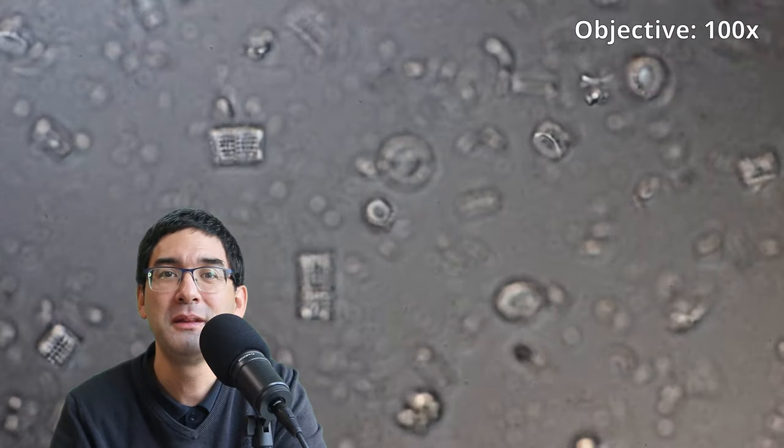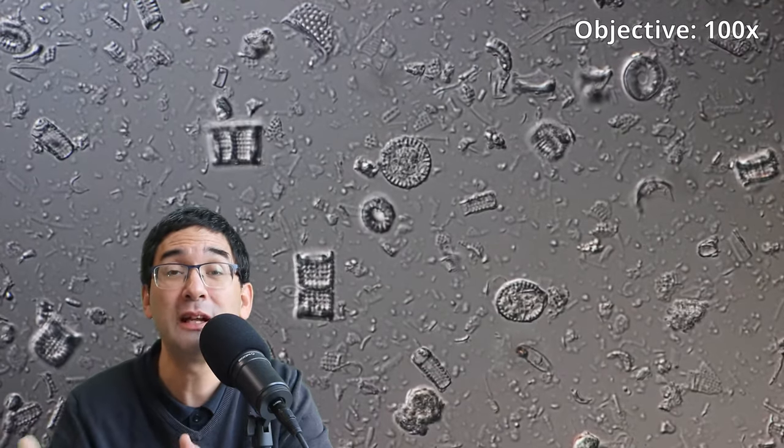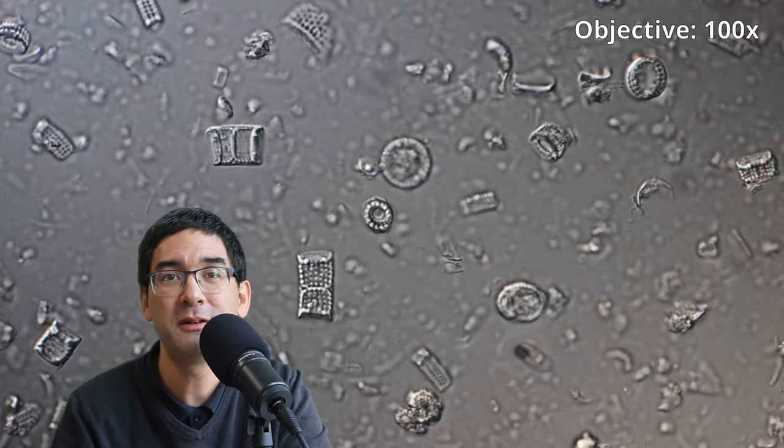And there are many historic microscope slides. I think they must be quite expensive because the collector's items where diatoms have been arranged.